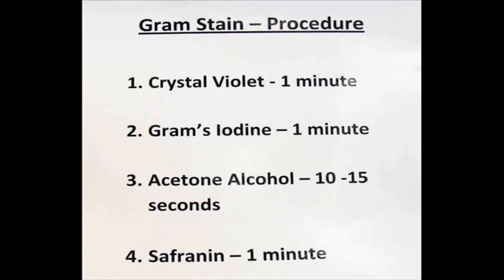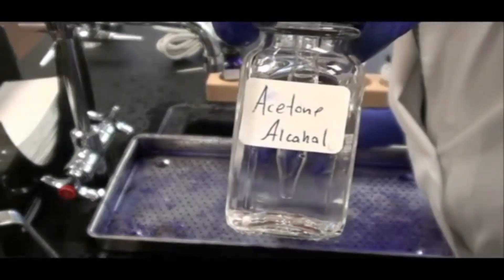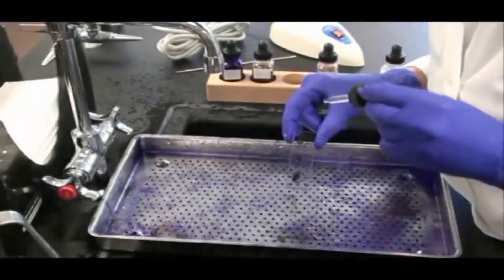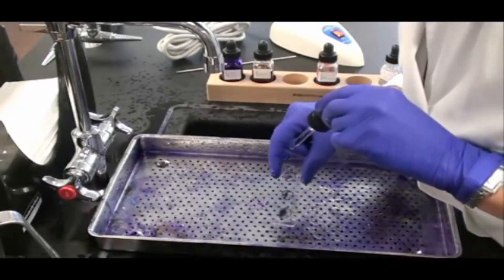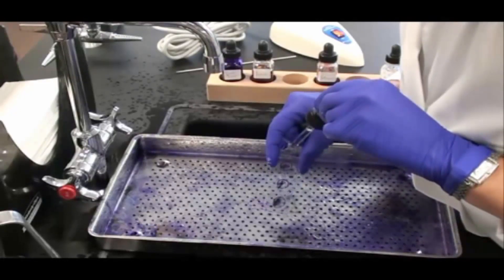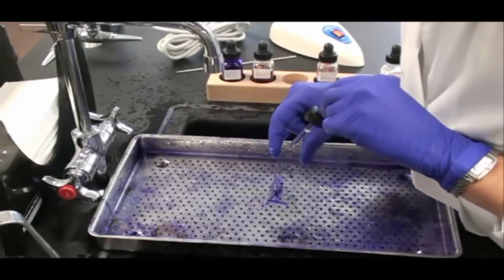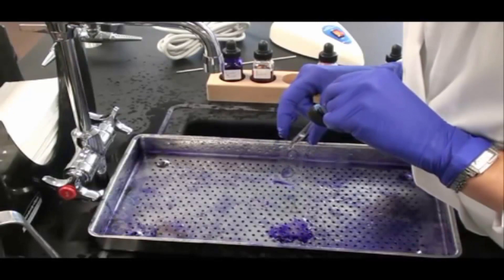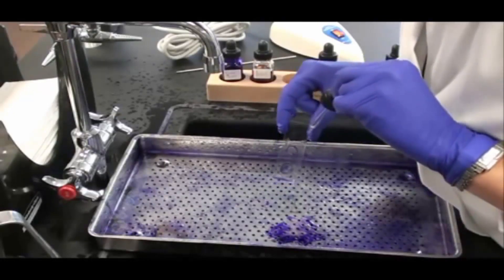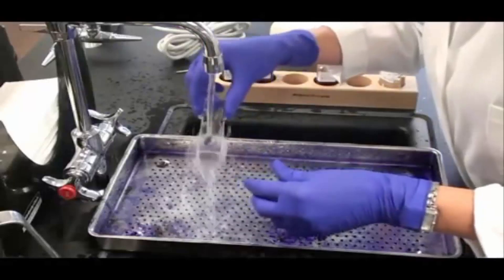My next step is to apply the decolorizer acetone alcohol. What this step will do is remove the purple stain from my Gram-negative cells. I like to hold my slide at an angle vertically and drip that decolorizer down the slide. That way I can see the color being removed from the Gram-negative bacterial smear and then I know things are working right. I let that drip for 10 to 15 seconds and watch that color leave the Gram-negative control. Then I rinse.